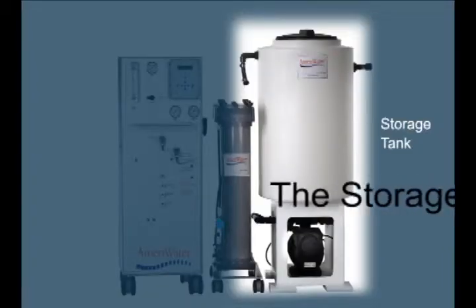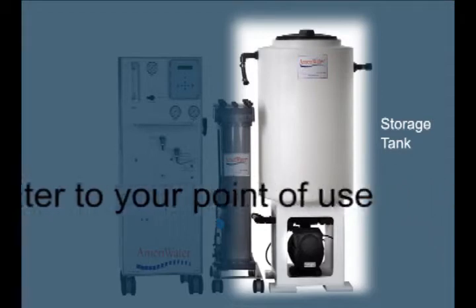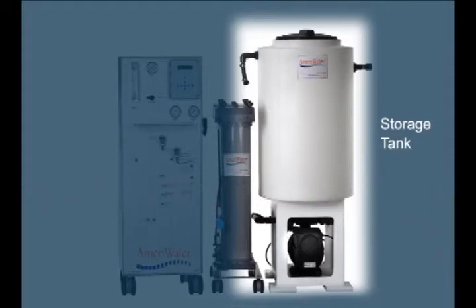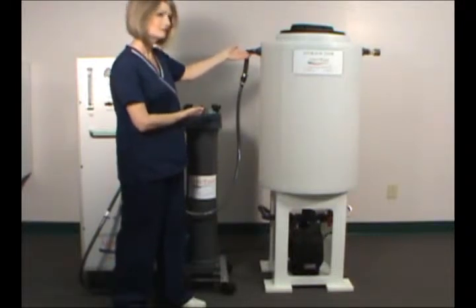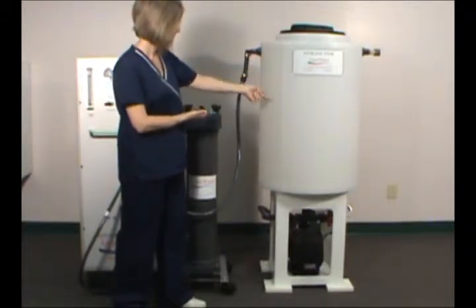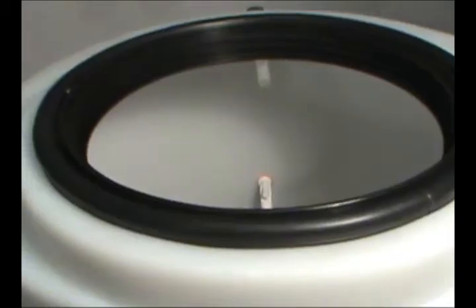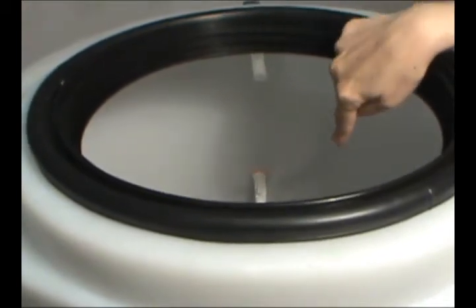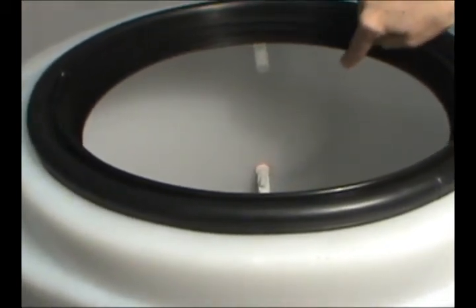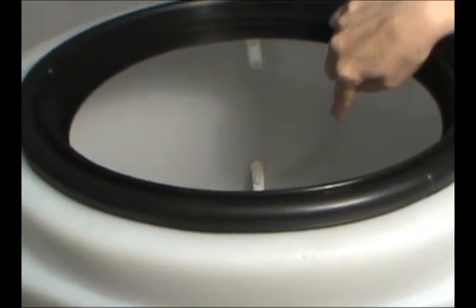The third component of AmeriWater's high quality water treatment system is the Storage Tank and Distribution Pump Package. Purified water from the Deionizer enters the storage tank at the top, allowing it to store a constant source of high quality water. Inside the tank, two float level switches control the on-off operation of the RO. When the water level drops from the top switch to the bottom switch, the RO turns back on.